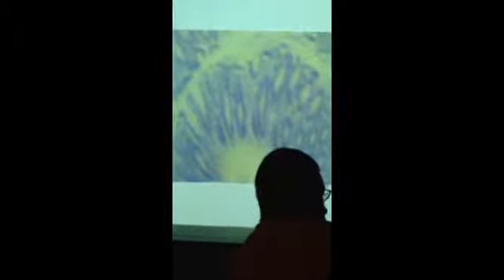Thicker mucosa. A second difference is there are no villi in the large intestine, as there are in the small intestine. So thicker mucosa and no villi in the large intestine.